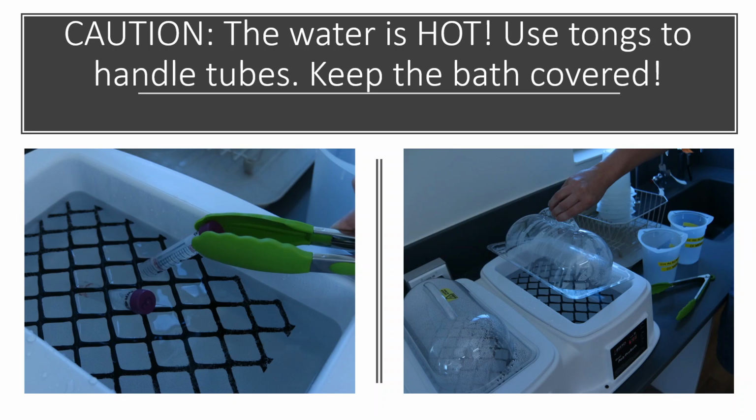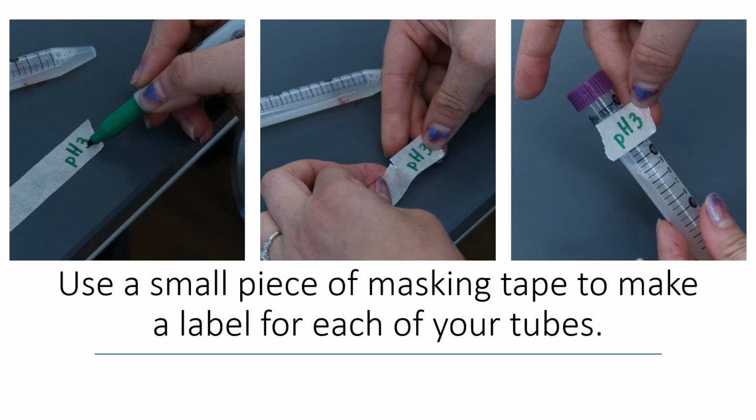As always, I remind you all that if you're using very hot things like the hot water bath, to always use tongs because the tubes get hotter than you think they will, and we don't want anyone getting hurt over the course of the semester.